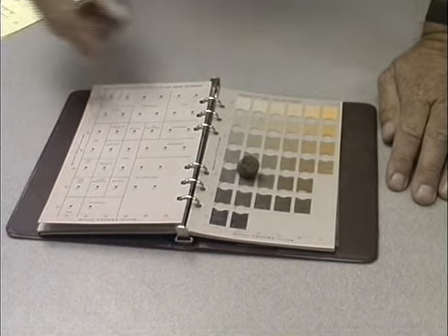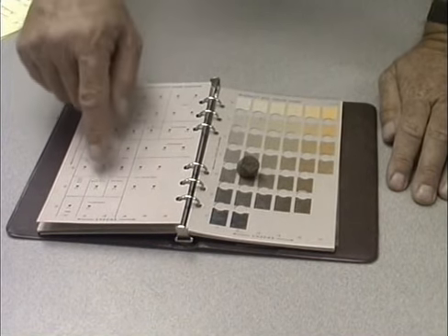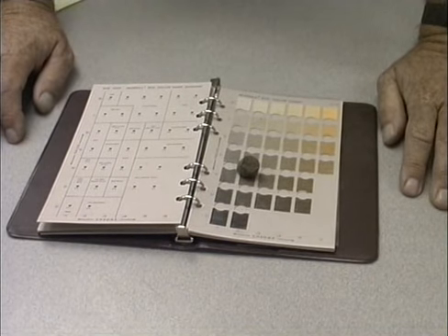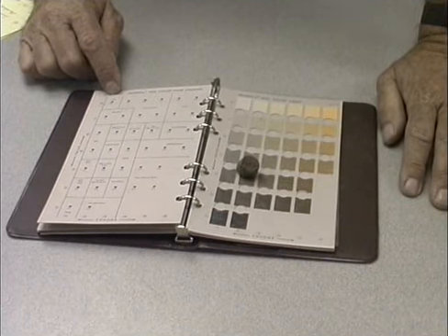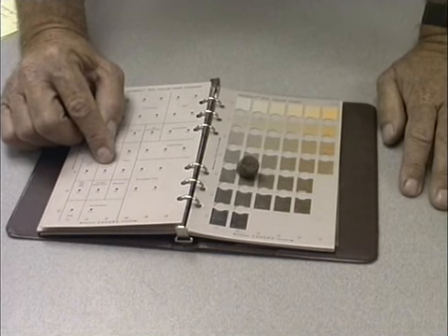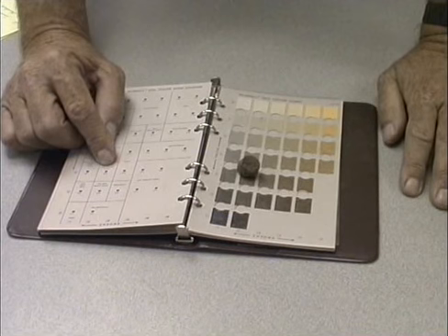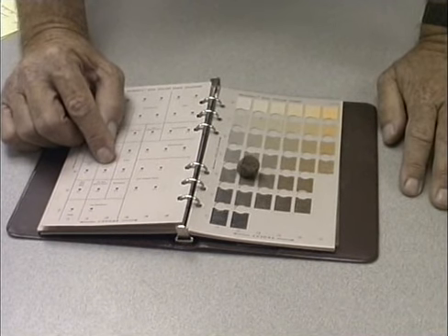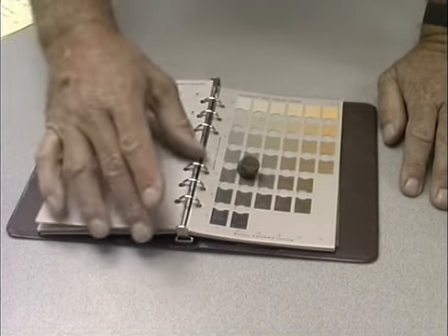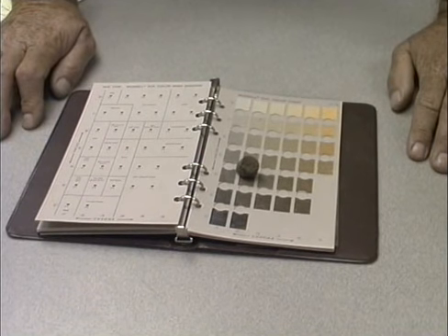What does this all really mean? Well, if we look across on the opposite page of this chart, we'll see that each of these soils has been given a color name based upon groupings or where they occur on the chart. So for the hue 10YR, the value of 4, and the chroma of 2, this particular soil, by common name, or Munsell soil color notation name, is called a dark grayish brown. So that is the procedure we would use to determine soil color based on the Munsell system.